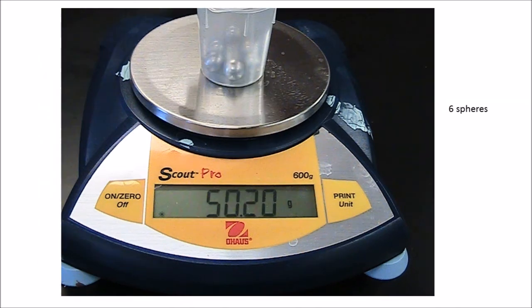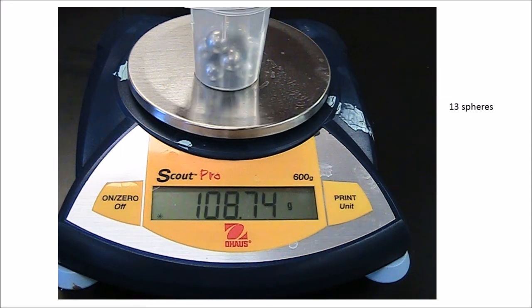Then I add some more in, so I'm up to 6 spheres piled up inside my container here, and the mass now is reading 50.20. Then there's 13 spheres, and you can try to count them if you want to, but it doesn't matter. The mass of those is 108.74.